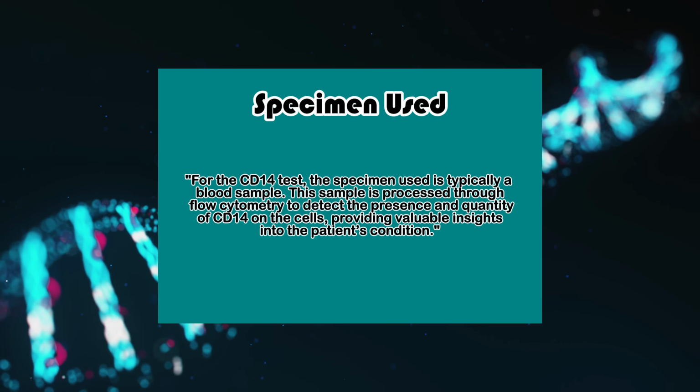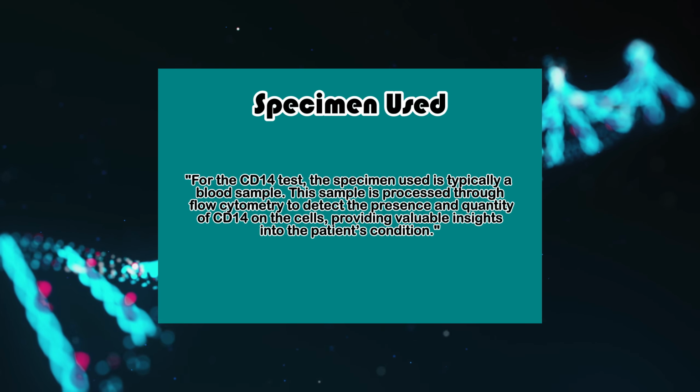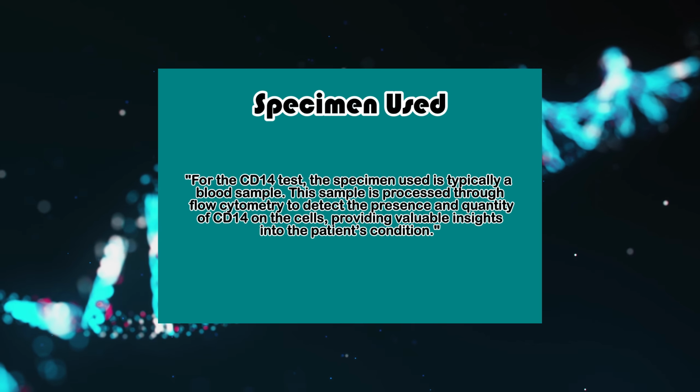Specimen used. For the CD14 test, the specimen used is typically a blood sample. This sample is processed through flow cytometry to detect the presence and quantity of CD14 on the cells, providing valuable insights into the patient's condition.